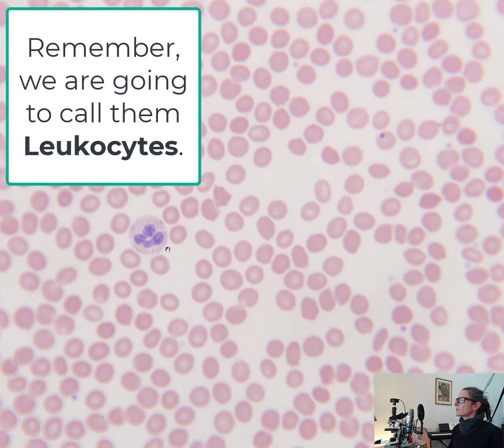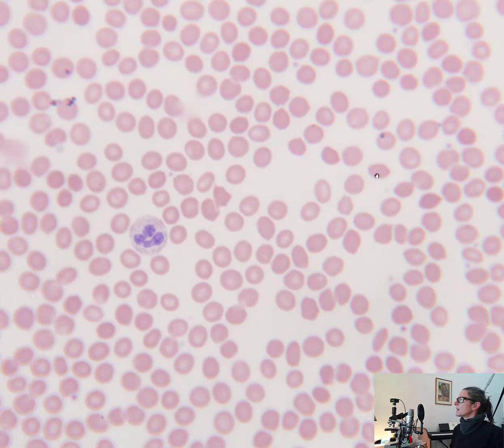The cytoplasm of the white blood cell can range from almost pale to a very pretty orangey red color to very dark blue, depending on the type of white blood cell we're looking at. So once again, we have our erythrocytes, we have a white blood cell, we have platelets, and we have the plasma, which is the specialized matrix that we see in blood.